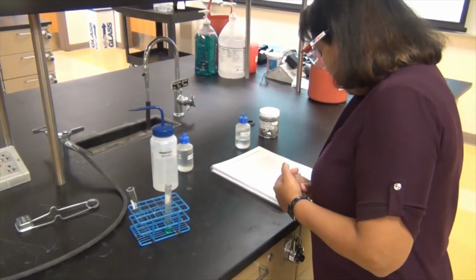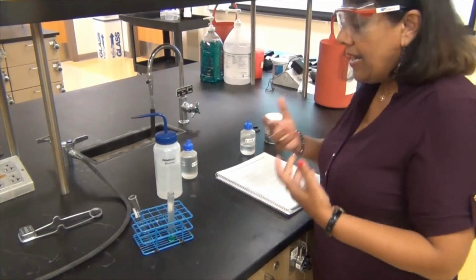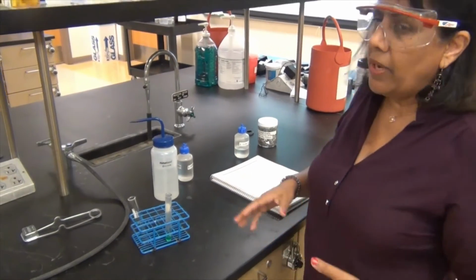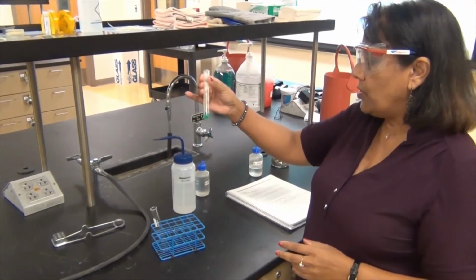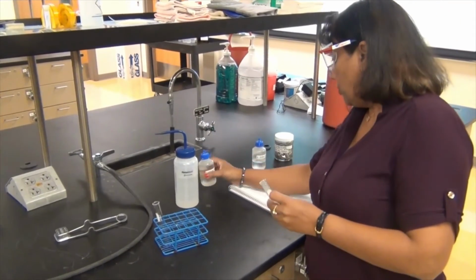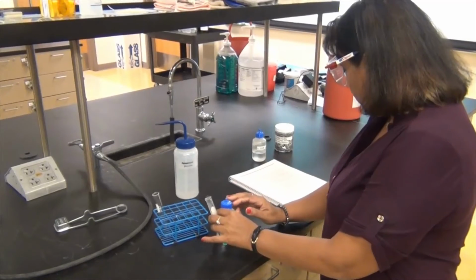Okay, so now we're going to go on to part B, which says add sodium hydroxide. Now technically it says that you need an ice bath, but you don't really need an ice bath, okay? We'll be fine without the ice bath. Trust me on this. Again, I hope you trust me by now, okay? But in any case, we'll add the sodium hydroxide.